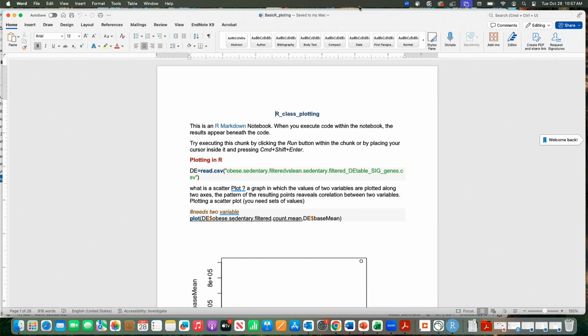Everybody is fine? Okay. You need to upload three files, the ones that are not documents.